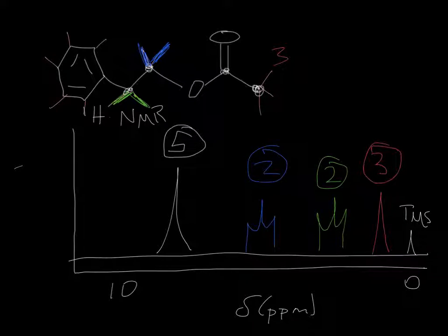You've got to practice this over and over again. Once you do, it's not that bad. And like I said, these are like little jigsaw puzzles. But just to review, this one is 5, because we have 5 hydrogens hanging off of that benzene ring. And they just don't split each other. And the reason why, I think that the theory behind it is due to the resonance structures that are on it. But I would never ask you the theory behind it.